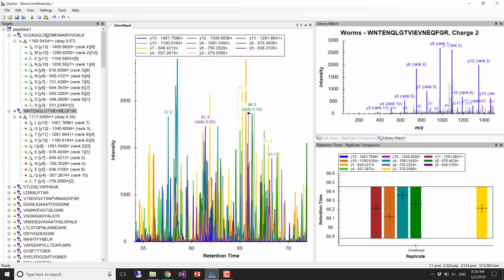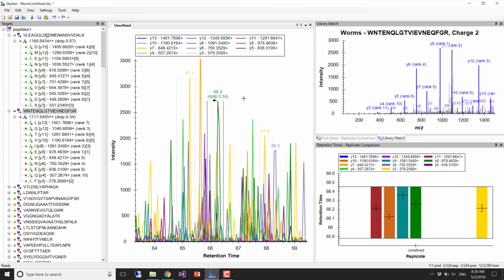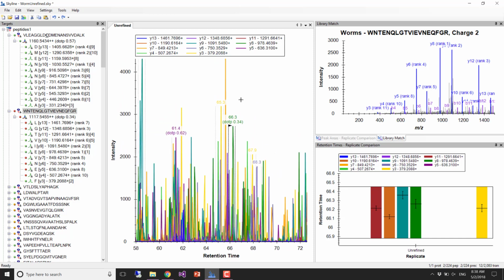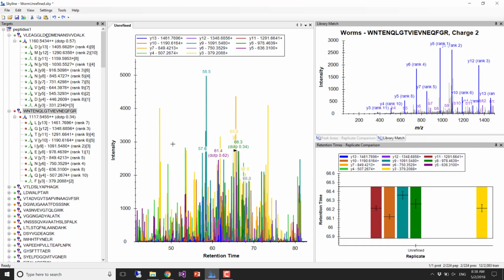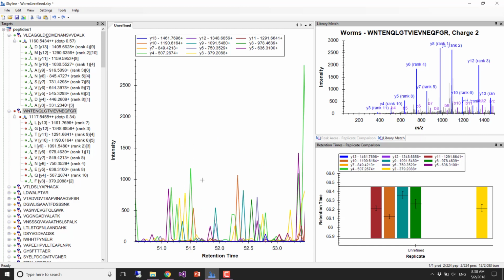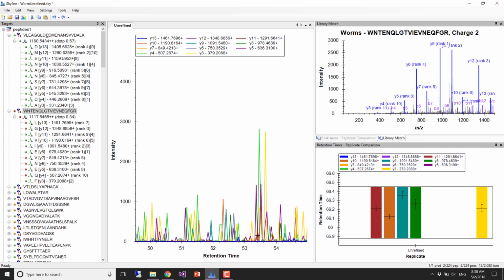Yeah, the red dot off to the left is telling us that what is selected is garbage, right? But you might wonder, well, Skyline's pretty good, so it's not that likely that there's some beautiful peak around here somewhere. Let's see.